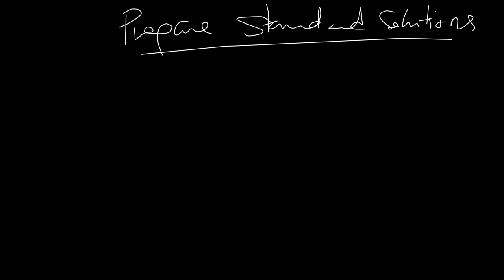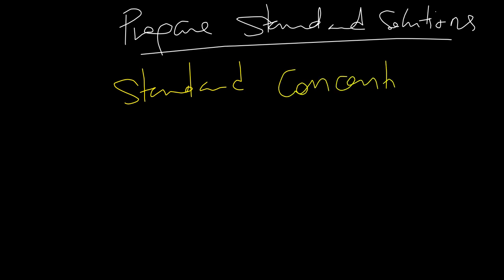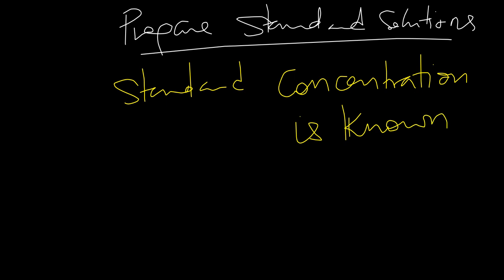So a standard solution is a solution whose concentration is known. So any solution whose concentration is known is a standard solution.